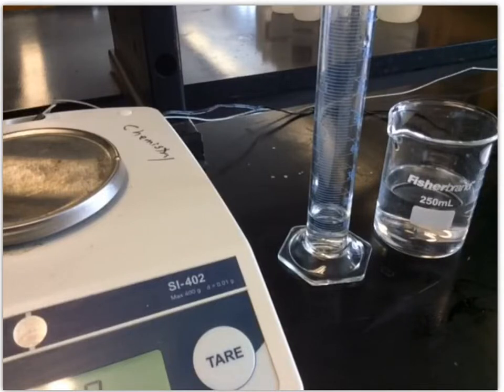We can do that by comparing the density of this unknown solution to the density of known concentration solutions. When you get to the lab assignment, I have a plot of density versus concentration for salt solutions, and you can utilize that plot. I fit a trend line to it and there's an equation there, so you can actually mathematically calculate it. Based on the density that we get, you can calculate the concentration or even look at the graph and draw a line from the density that you find to the trend line and down to the concentration on the x-axis.